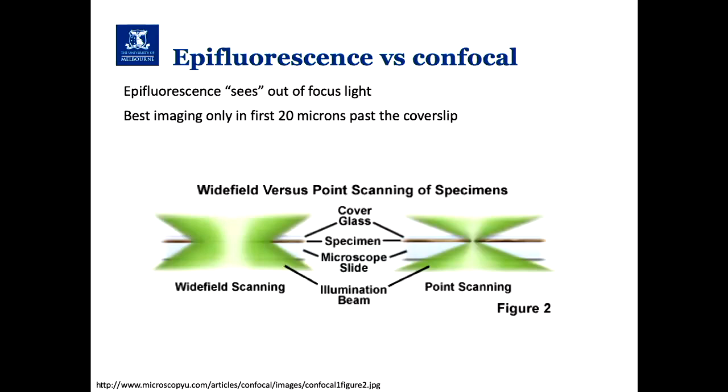Okay, we'll cover the confocal over the next few slides, but just to say, rather than illuminating the whole field of view at any one point, we're scanning a laser across the sample. One of the nice things on confocal is it's not going to cause as much photo damage as you get on wide field imaging.